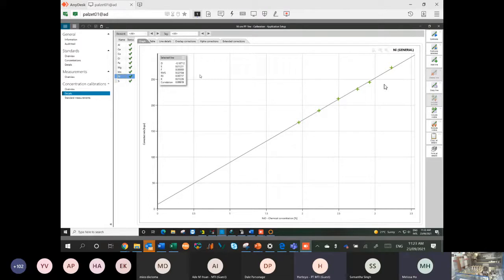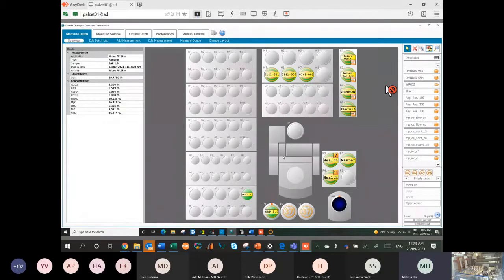Yes, Harry, I see that we do have some questions from our audience. Let me go with just a couple. So what you mentioned regarding the add-ons, just want to check whether they're compatible with Axios and older models. Yes, they are. Some of them are, not all of them.